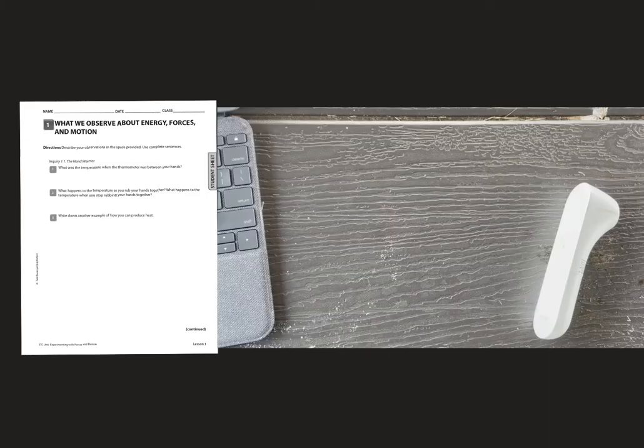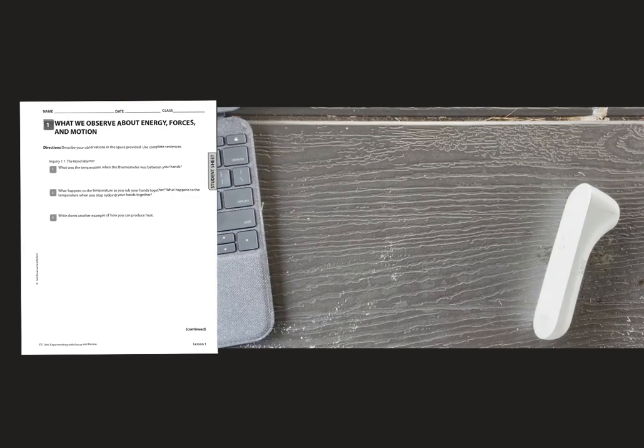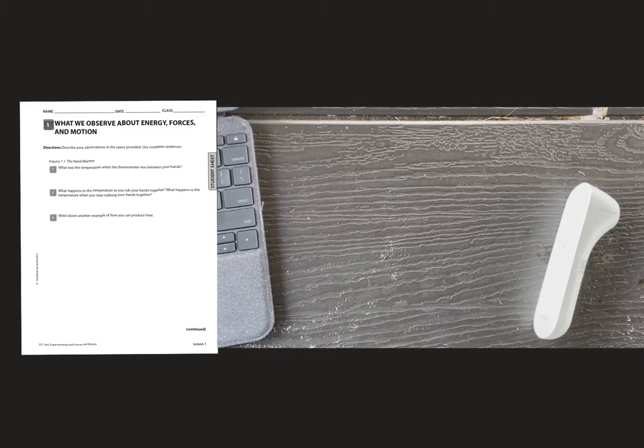All right, guys, so this is station 1.1 or inquiry 1.1 of the hand warmer. Make sure you are answering these questions in your science notebook as the video rolls. All right, guys, so this is your video for 1.1, the hand warmer.